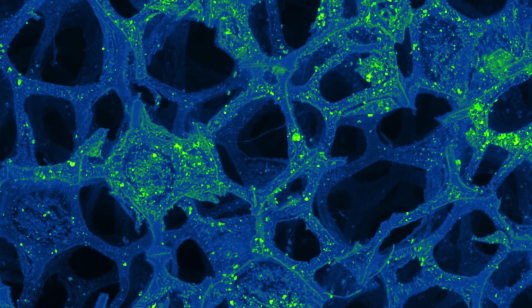One other thing you might be curious about is, why is it blue and green? So when you take the image in the SEM, it's a black and white image that shows contrast, and then you can modify the contrast to make something that would be black otherwise blue, and something that's white otherwise green. So I applied the color afterwards to highlight the nanomaterials, but that's not intrinsic to the SEM process.